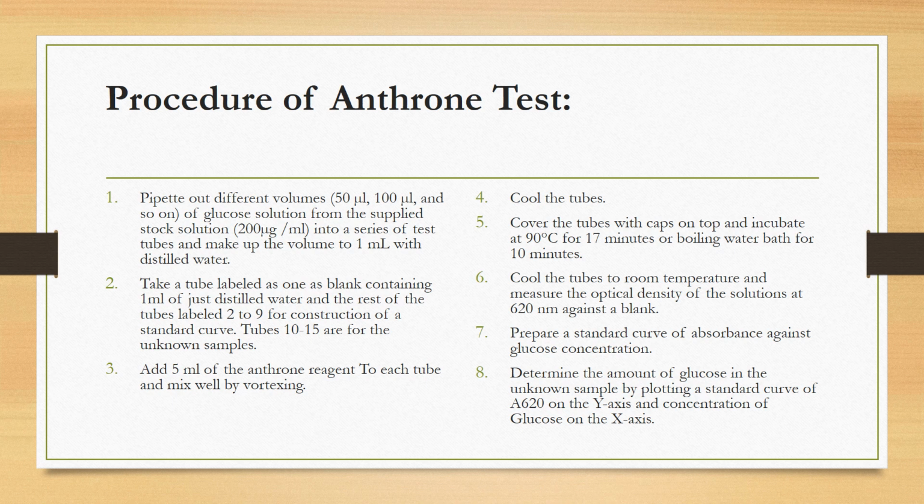The procedure of the anthrone test, we can stop at the point of checking if there is a presence of carbohydrate or not, whether it's positive by forming the bluish green complex or not.